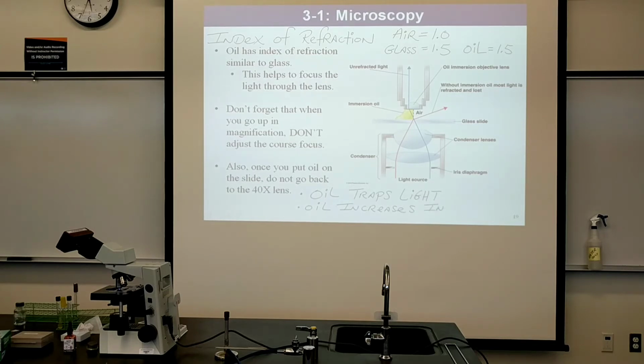And because it's the same as glass, that increases the clarity under the highest magnification.